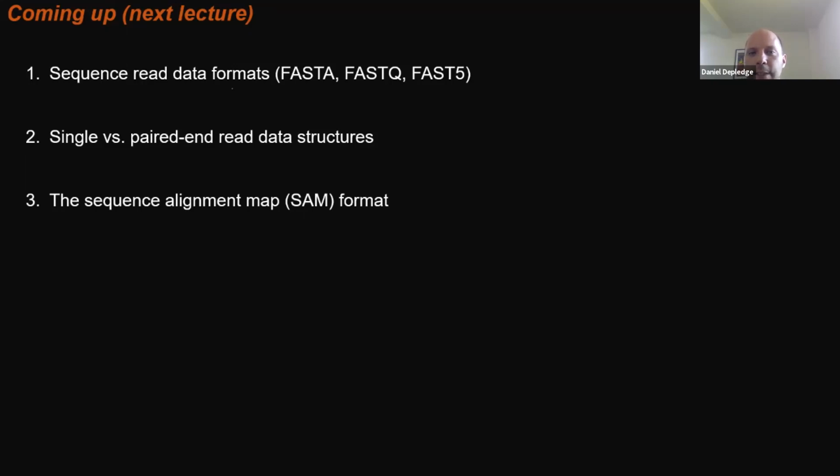This might all sound a little bit dry, but it's absolutely a crucial step in learning about sequencing informatics. If you don't know what the difference between these files are, if you don't know how to parse them, if you don't know what all the different things that you can find in the SAM file mean, you're going to have a lot of problems in your downstream analysis.